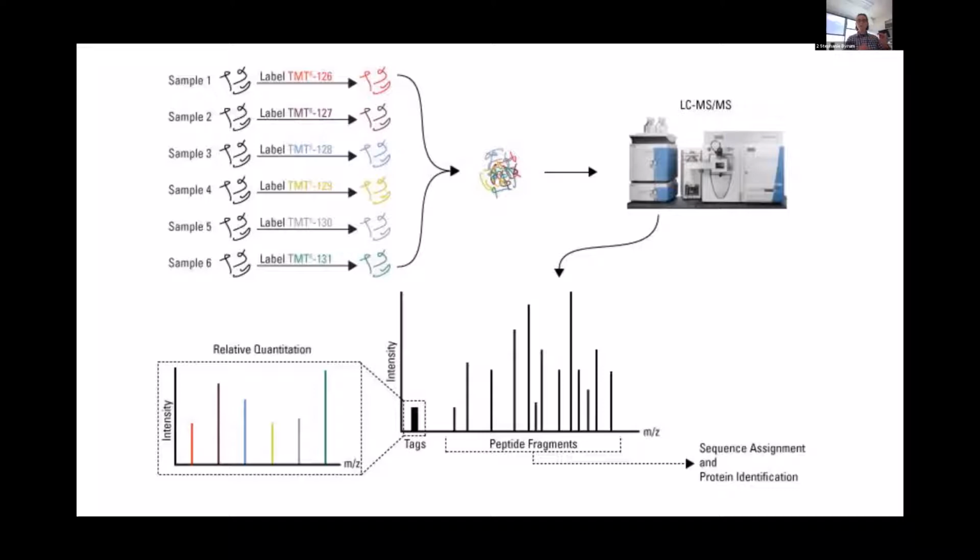So when it hits the MS1 and it's looking for the most abundant peptides, that can be variable depending on what peptides elute from the column at that moment in time. If you have a set of 10 abundant peaks that come off at the MS1, but then you've got 5 other ones that vary in elution profiles between your samples, you can get this smattering of missing values in all of those different samples.